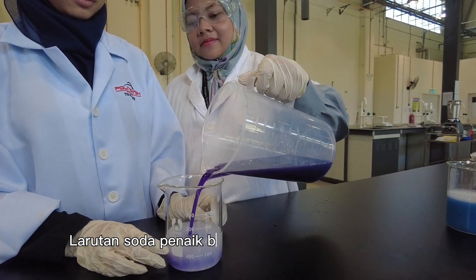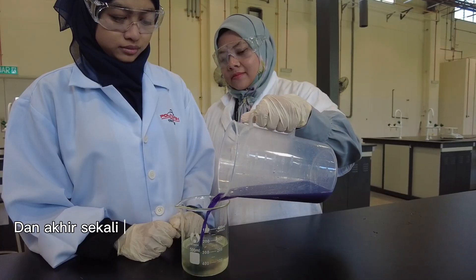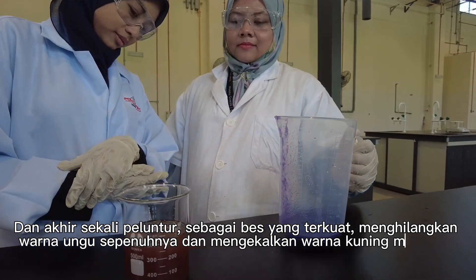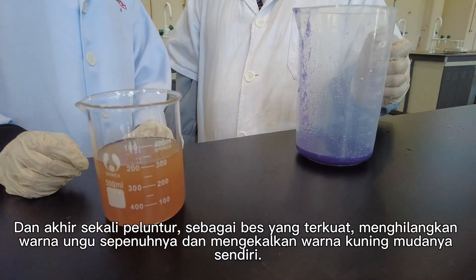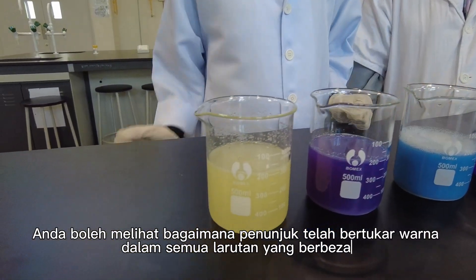The baking soda and water solution turns a bluish-green shade. And finally, the bleach, being the strongest base of the lot, dissolves the purple color completely and retains its own light yellow color. You can see how the indicator has changed color in all the different solutions.